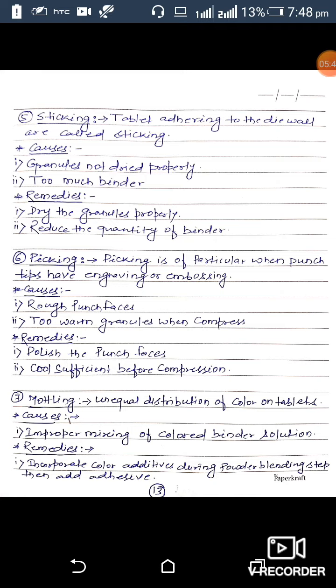The seventh defect is mottling. Mottling refers to unequal distribution of color on the tablet surface. The cause of mottling is when mixing of the color is not proper in the granules. The remedy for prevention of mottling is to incorporate the color additive during powder blending using a stepwise process, and to add adhesive. Thank you.